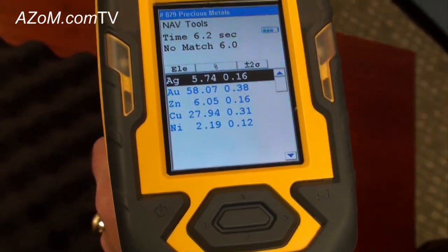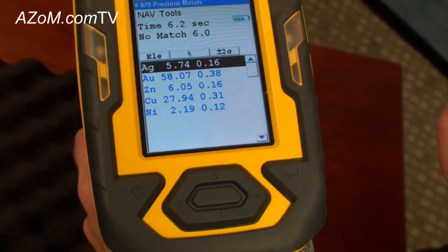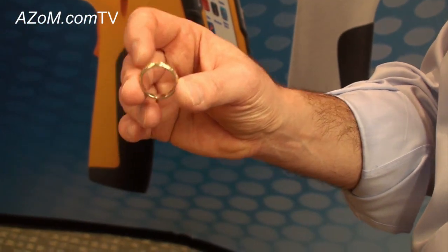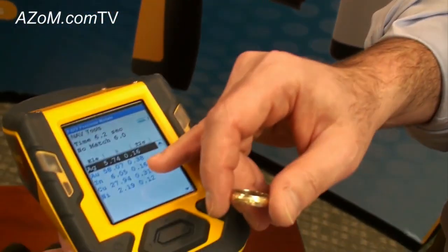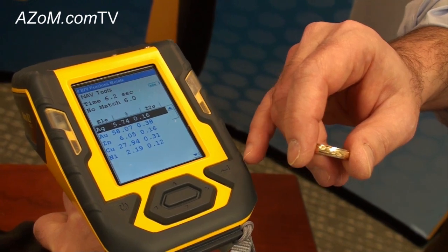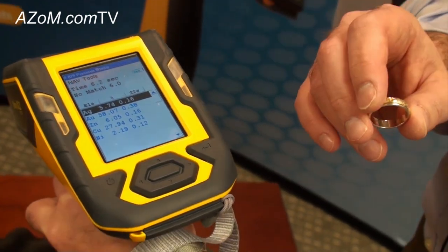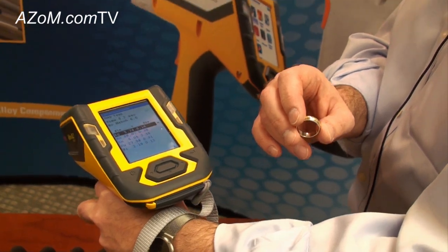What's interesting and different between this sample and the bracelet that we just measured is that this sample has both white and yellow gold — this ring. We can see not only that we have copper present in the sample, but we also picked up nickel, which is indicative of the element that's added to make white gold white.